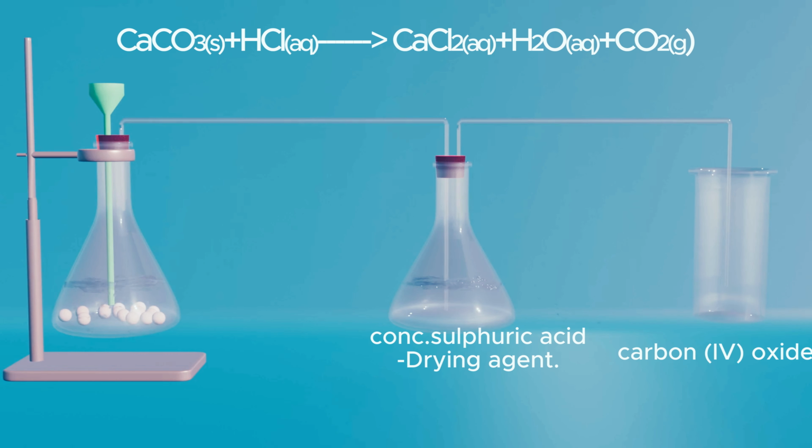The gas is passed through concentrated sulfuric acid to dry it. Carbon 4 oxide gas is denser than air and therefore collected by downward delivery.